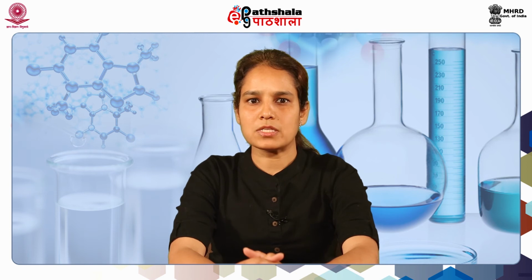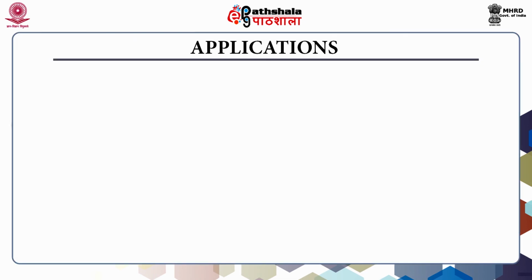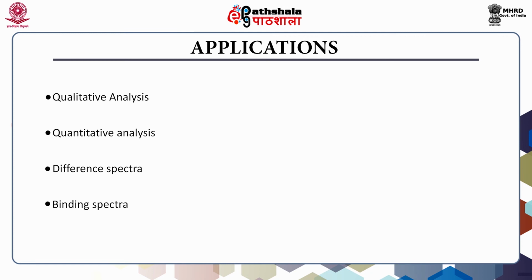By now, you must be clear that lambda max is the property of the chromophore, which is the part of the molecule. UV visible spectrophotometer has vast applications. To be concise, major applications include qualitative and quantitative analysis, difference spectra and binding spectra.